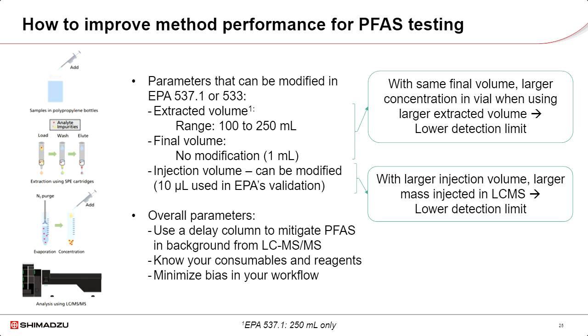In general, for PFAS, if you want to improve the overall performance of the method, don't forget to use the delay column. I refer you to our first webinar of this series to learn more about that. And know your consumables and reagents.